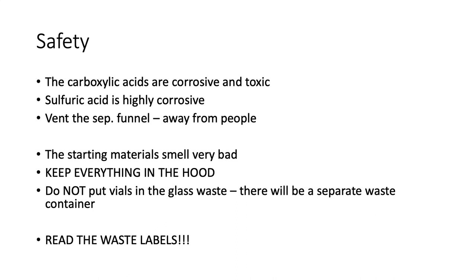Do not put vials in the glass waste. If anything breaks, or if you break a pipette, or a beaker or something that has contacted your solutions from the ester lab, there will be a separate waste container for those. Your TAs will come around with a capped plastic solid waste container to collect all your vials so that they are not in the glass waste stinking up the entire lab.